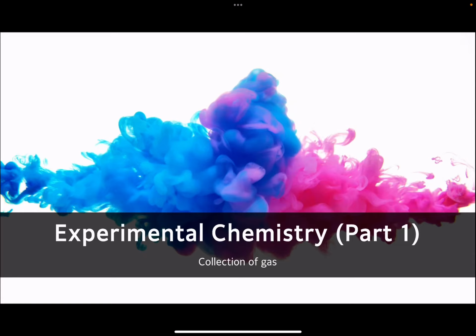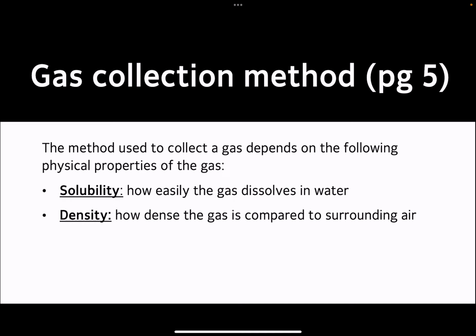So let's take a look at which methods there are, why we choose them, and when we choose them, in terms of the preferred choice of collection. We should be on page 5 of the notes. The gas collection method will be chosen based on 2 criteria. It depends on whether the gas you are collecting is soluble in water or not, and whether it is of a high density or a low density with reference to air.